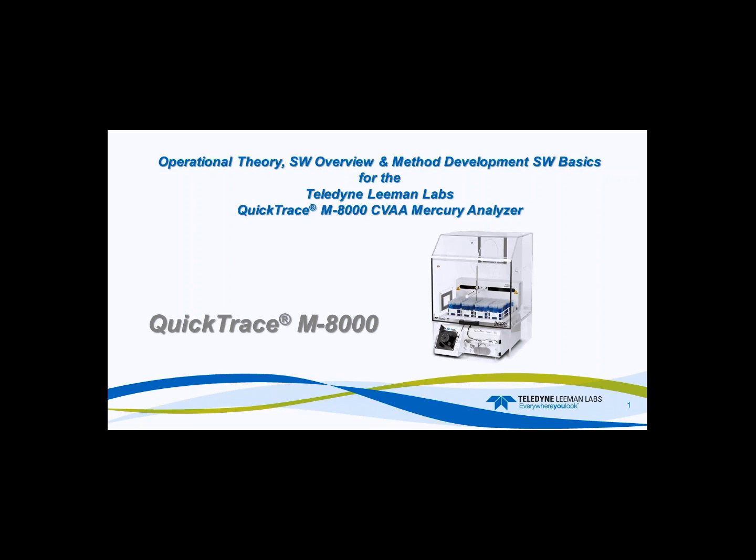As Shelley stated, we are going to go over software theory and some basic tricks in method development through the software.